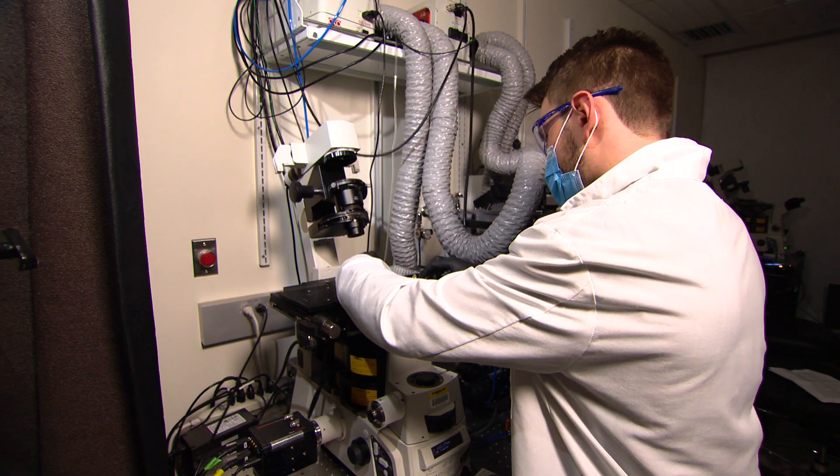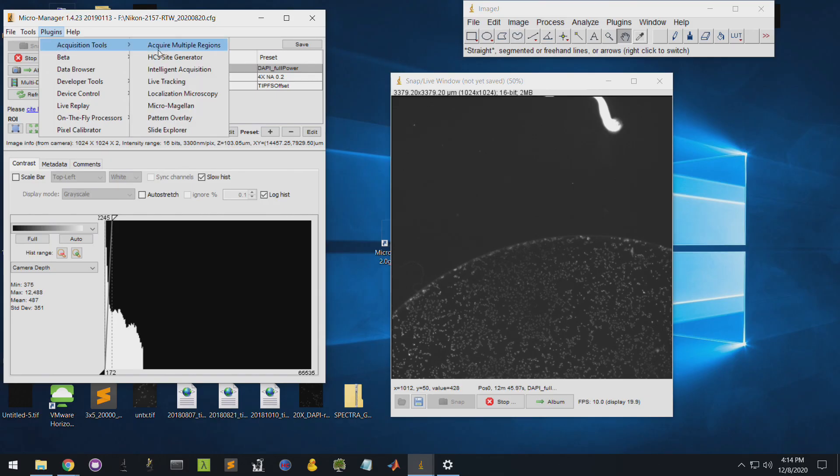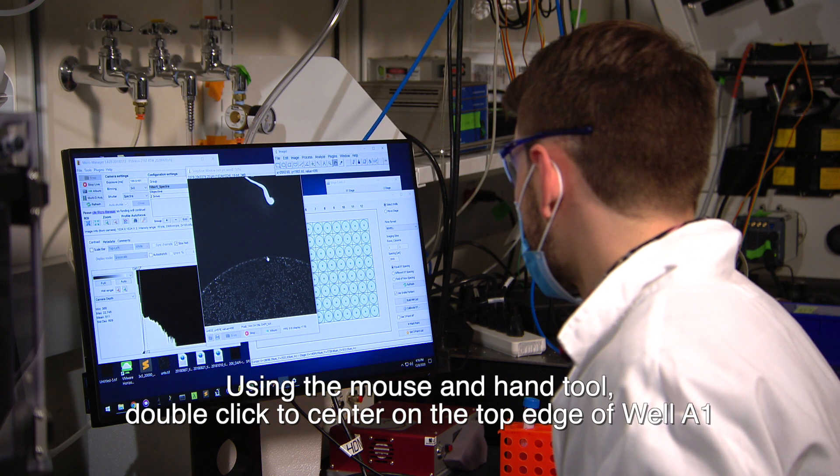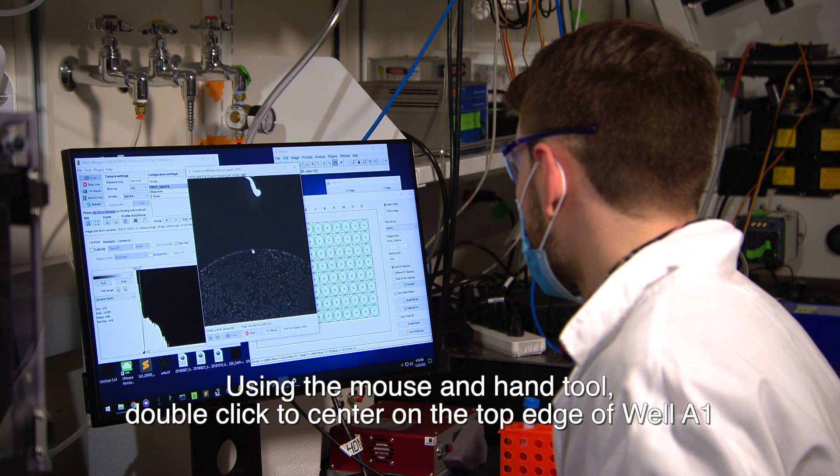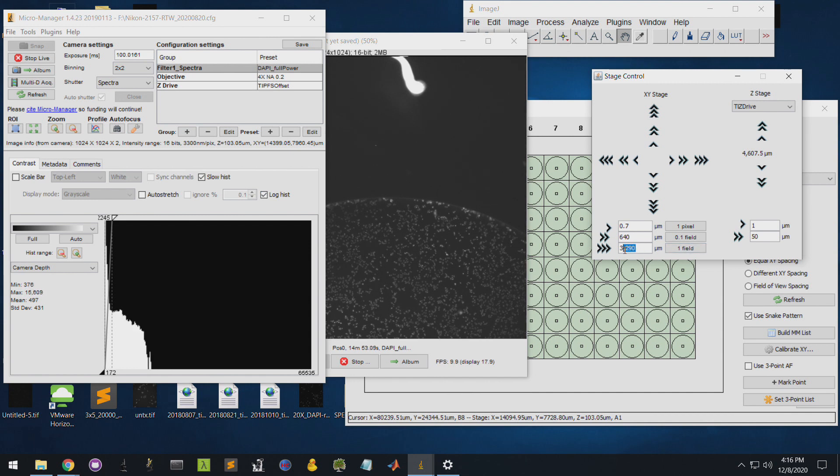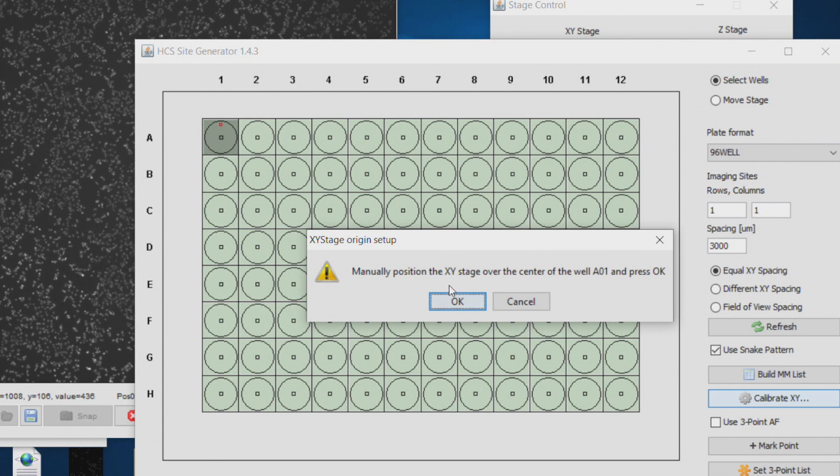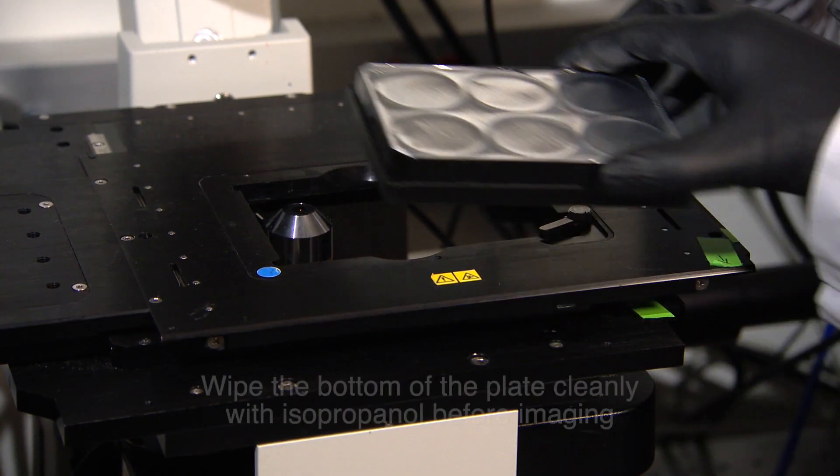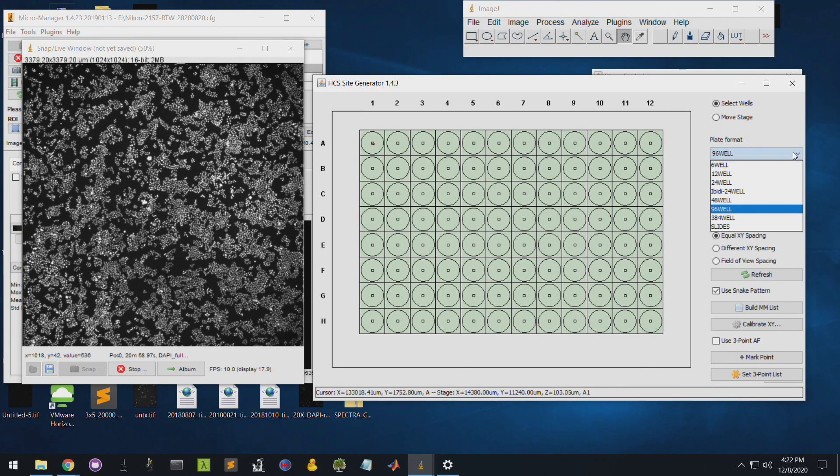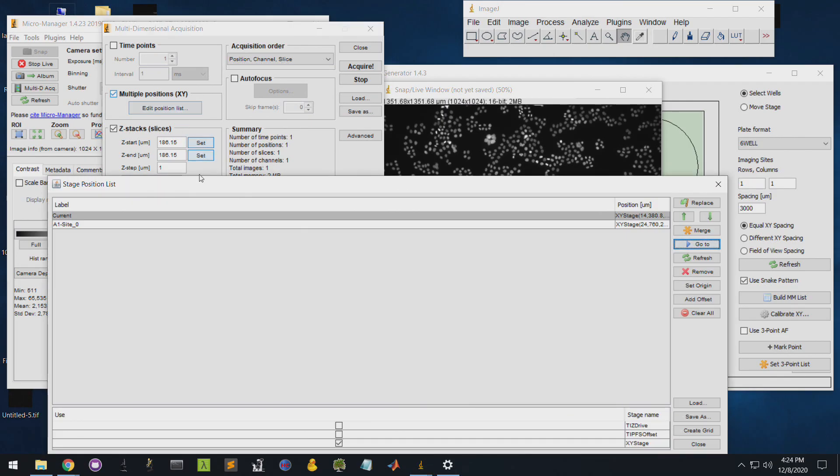For the Nikon TiE, first place a reference 96-well plate of DAPI-labeled cells onto the microscope stage to perform stage alignment. Next, load the HCS site generator plugin. Use the mouse move stage feature and hand tool to move the top edge into the center. Next, jog the stage to the center of the well using the stage control tool and known plate well diameter. Store the plate alignment using the Calibrate XY button in the HCS site generator.